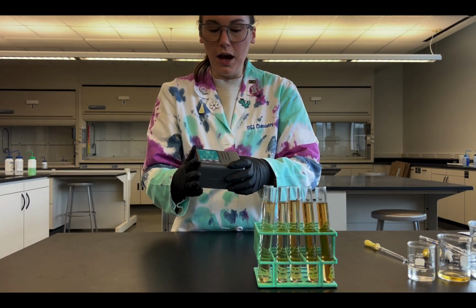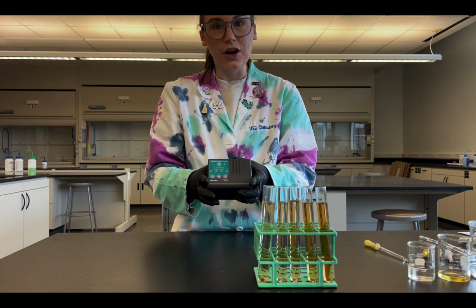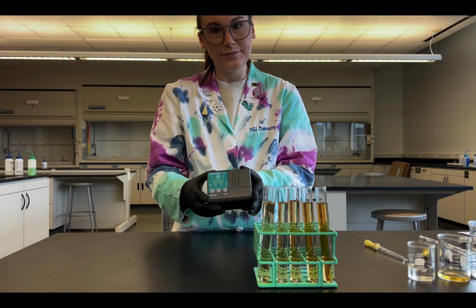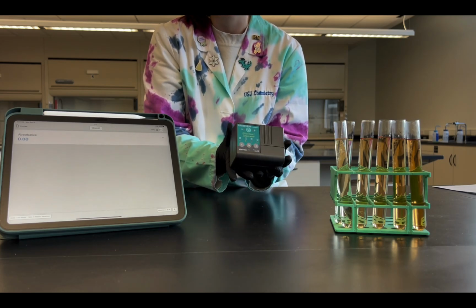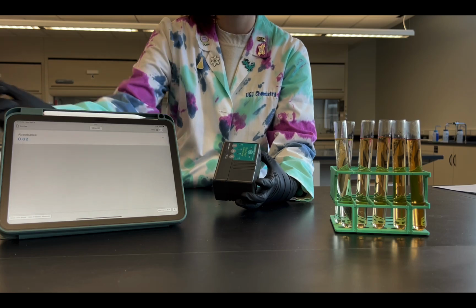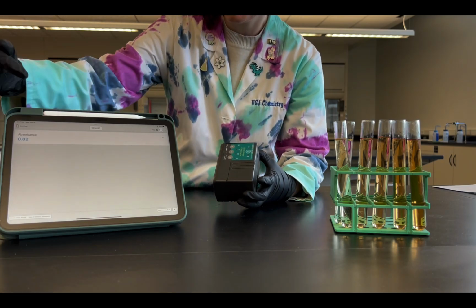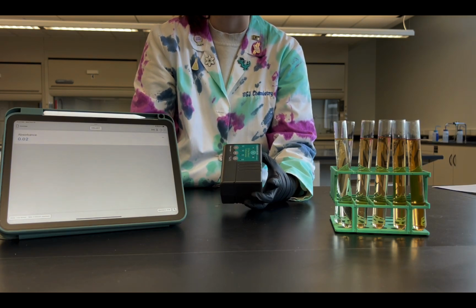So I'm going to set this up and start our readings for our different absorbances. My colorimeter here is wireless, so I have to connect it to an app on my phone or my iPad in order to measure the absorbance. That's what's shown on my iPad here. The absorbance is being read right here. Right now it's being read as 0.02.